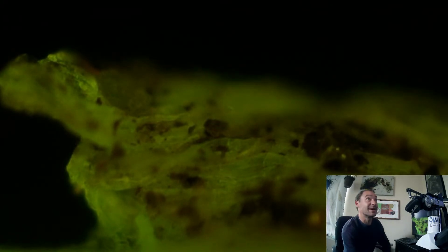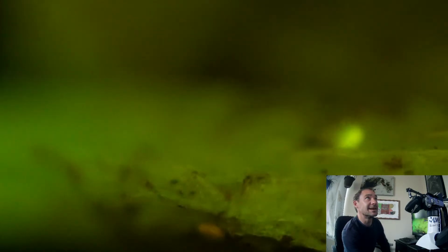Yeah. I really wanted to do this stream to just compare different roots. And it is interesting how all roots look different from one to the next. There's slight differences in all of them, in the thickness of their cell walls, how much they're glowing in between, how much they're overall glowing. Super fascinating.